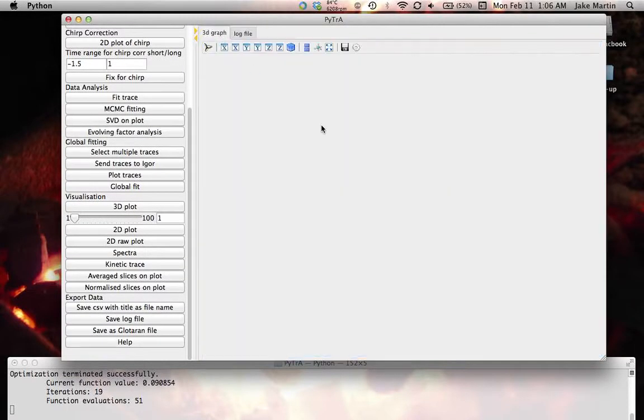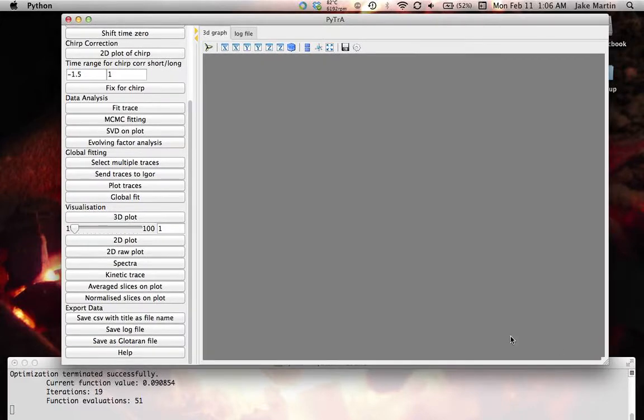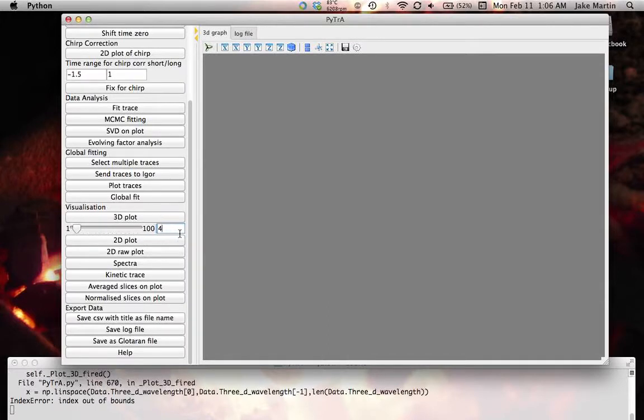So the other thing that we can do is we can look at the plot in 3D. So this here is a new thing, and this gives you the warp scaler. So this thing basically raises up and down the z-axis.